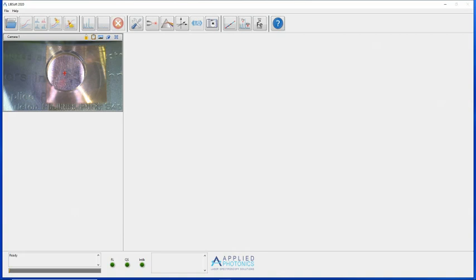The spectra acquired using LIBSoft are background corrected. If a spectrometer is connected to the system and has been successfully detected and initialized by LIBSoft, the application will automatically acquire a new background spectrum once all the hardware components have been initialized. Thereafter, if any parameters that affect the background spectrum, for example the spectrometer integration time, are changed, then a new background spectrum is acquired automatically before subsequent analysis spectra are acquired.